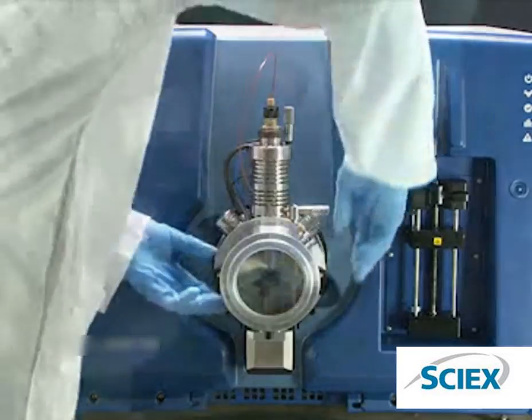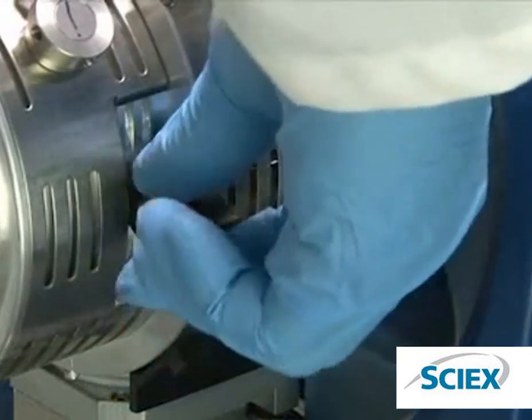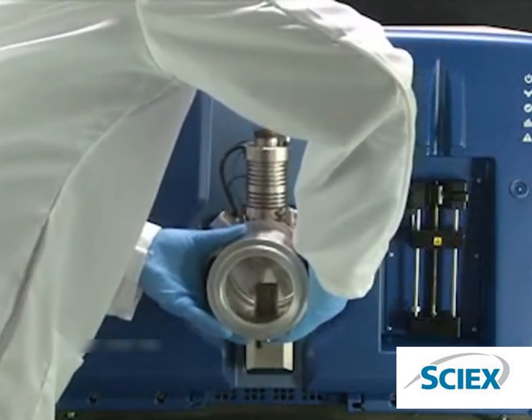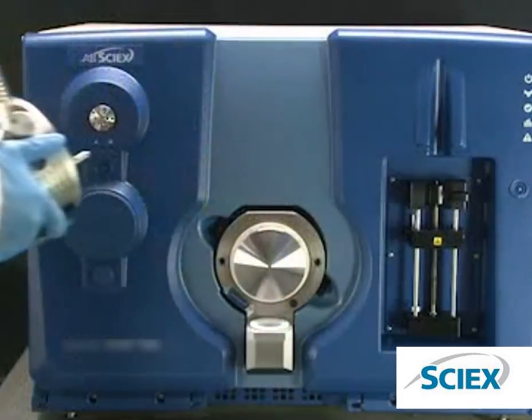To unlock the ion source, turn the source handles upwards to release it. Next, firmly grasp the outside of the source with two hands and pull the source away from the mass spectrometer.